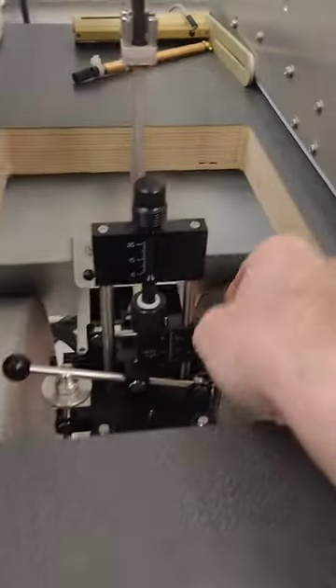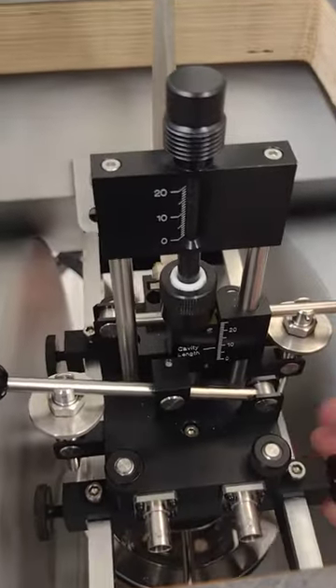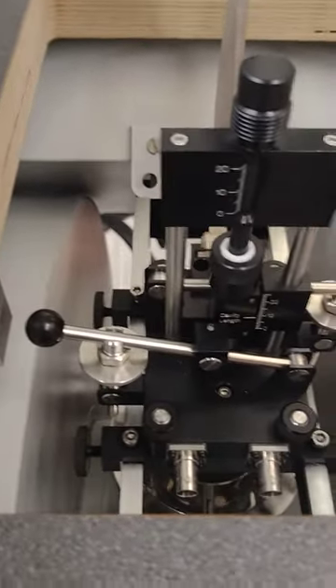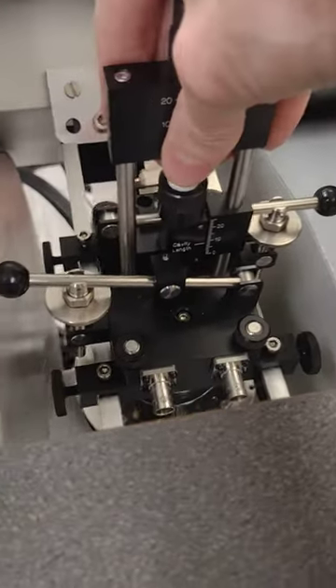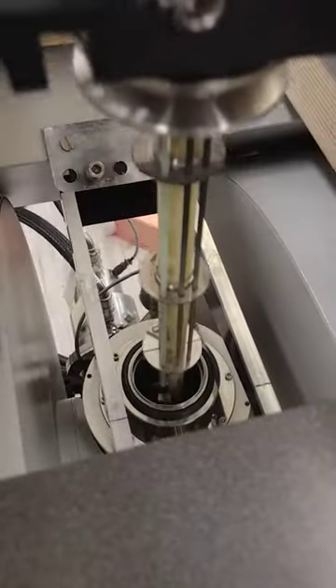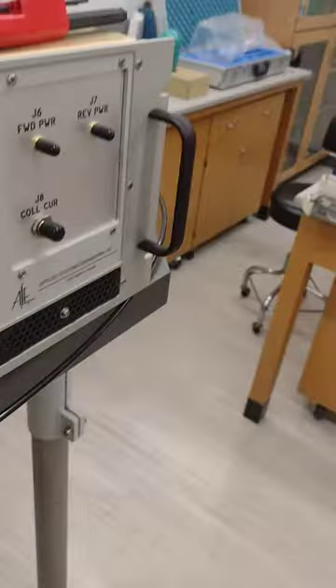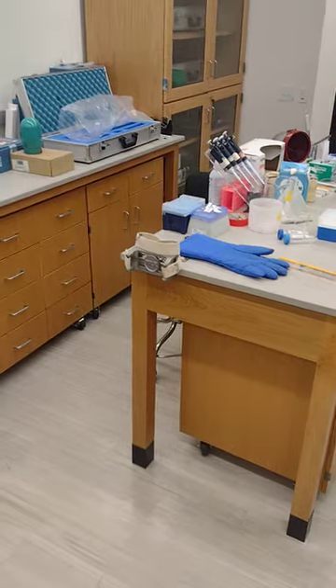Once you loosen all the stabilizing screws that hold the resonator tightly onto the mount, you can then carefully pull your resonator out. Set that down over here gently.